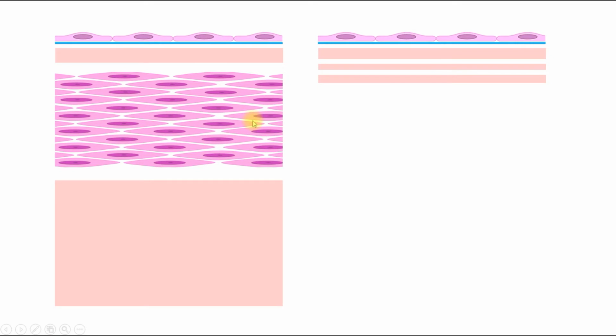And let's go to the classification of veins. There are different types of veins, and two basic types are muscular and amuscular. Here we can see that this type is typical. It has well-developed muscles in the tunica media.